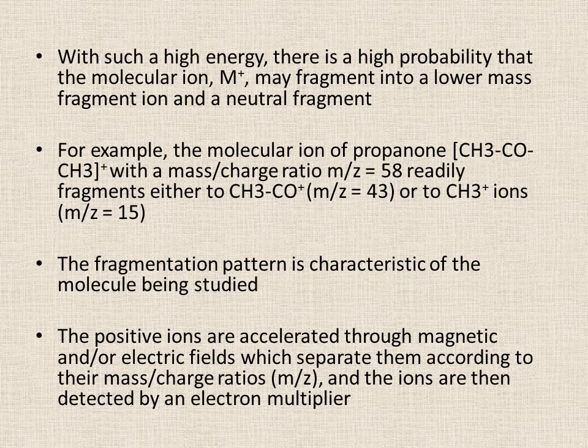So these positive ions or fragments which are formed previously are subjected to electric and magnetic fields, which separate them according to their mass to charge ratio, and the ions are then detected by an electron multiplier.